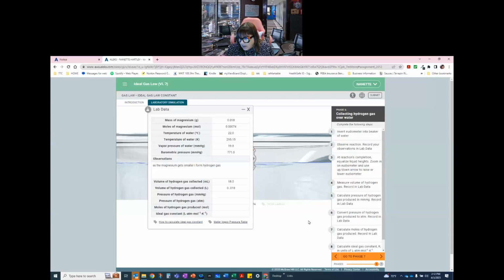The pressure of the hydrogen gas is 751.184, and that is the 771 subtract the 19.8, which is the water pressure. So that's 751.2. And so I put that right there, 751.2. And then I have to convert that to atmospheres. I'll let you find that conversion, 0.988.